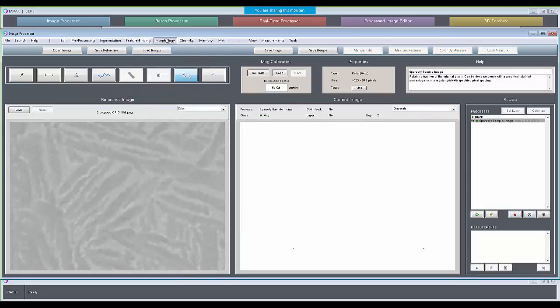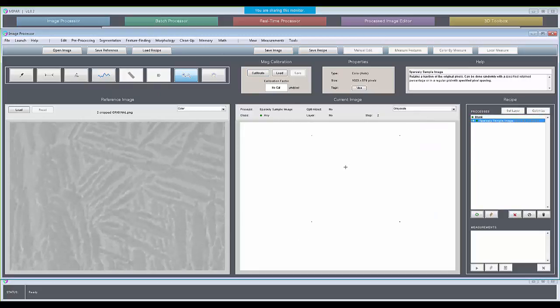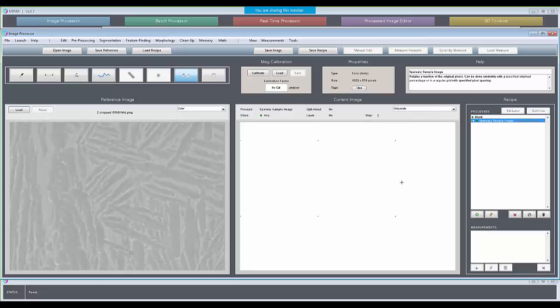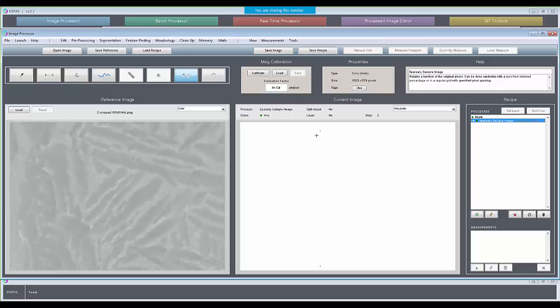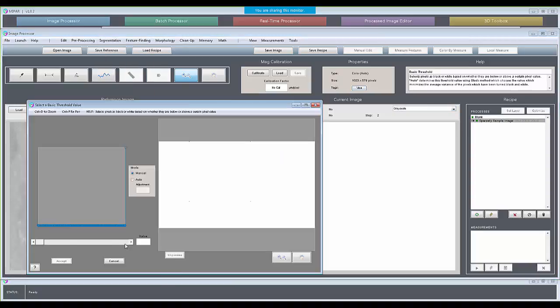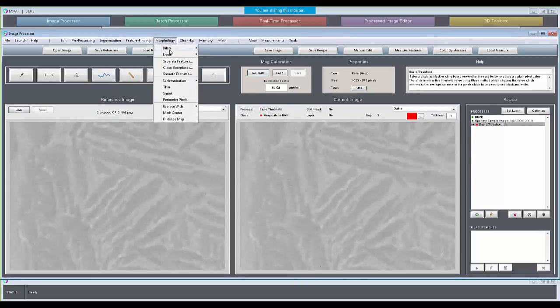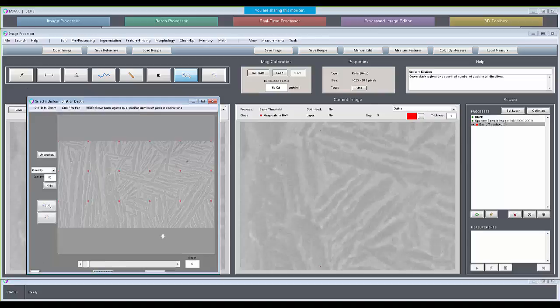Let me take that sparsely sampled grid and okay, that is another issue that we need to take care of here. The sparsely sampled grid is being seen as a grayscale image for some reason. We can just threshold on it to work around that. Sorry about that. And then we're going to dilate these points just a little bit.